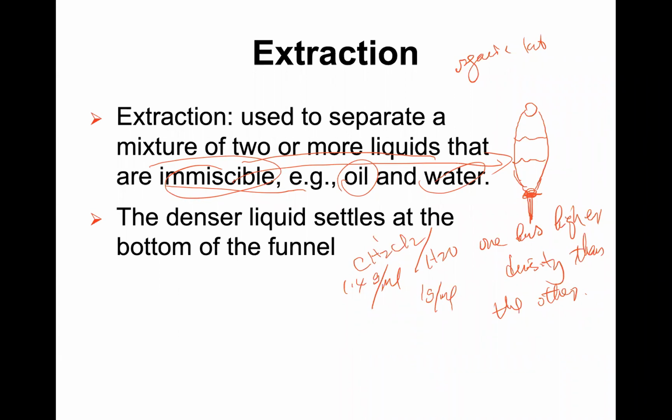And then your compounds, according to their compatibility, which one is more compatible with the water, with the methylene chloride? For example, water is more polar, so in this case we apply like dissolves like. That means that if you have a polar solvent, what dissolves a polar component?